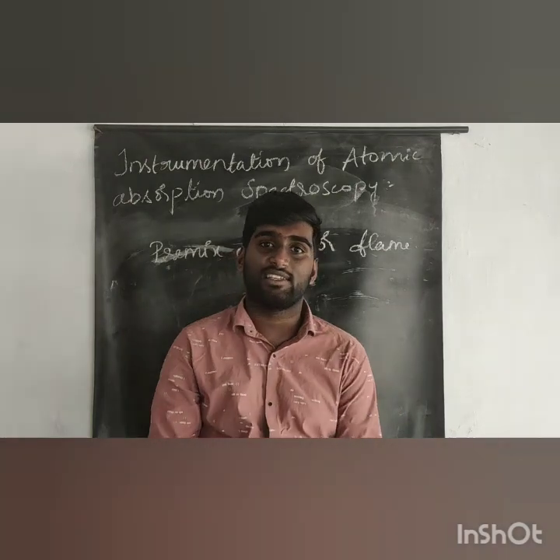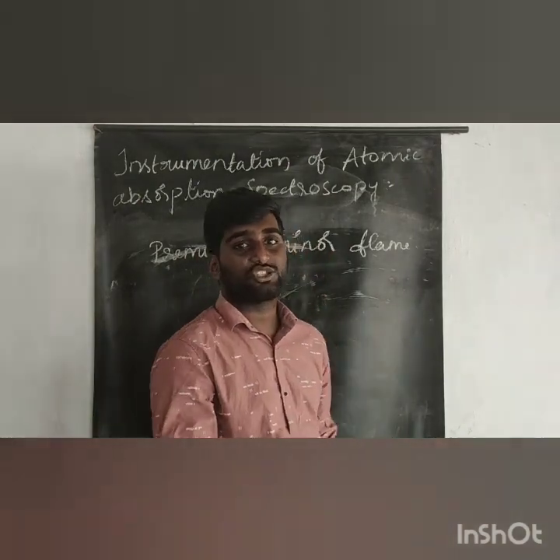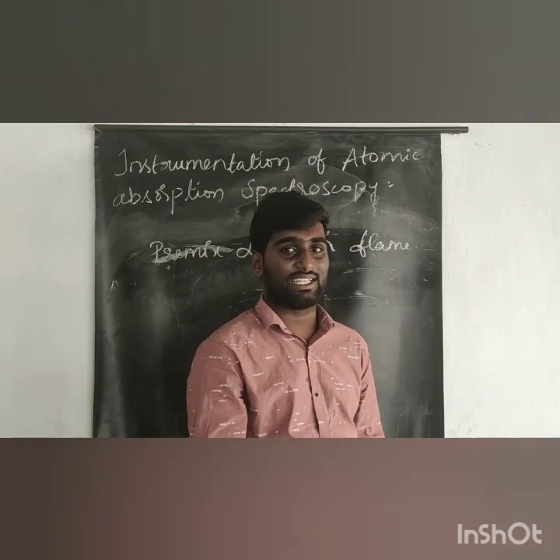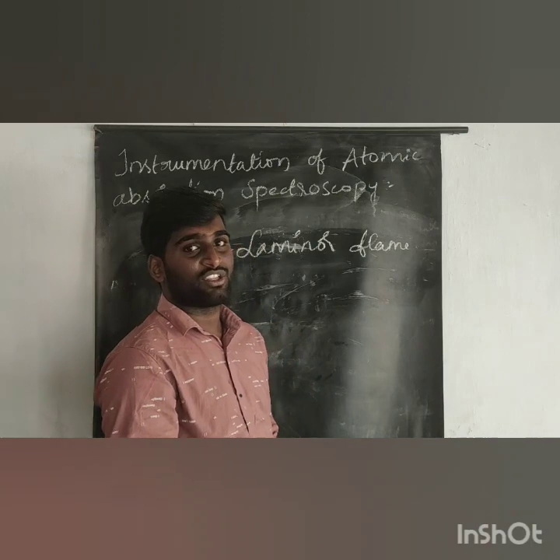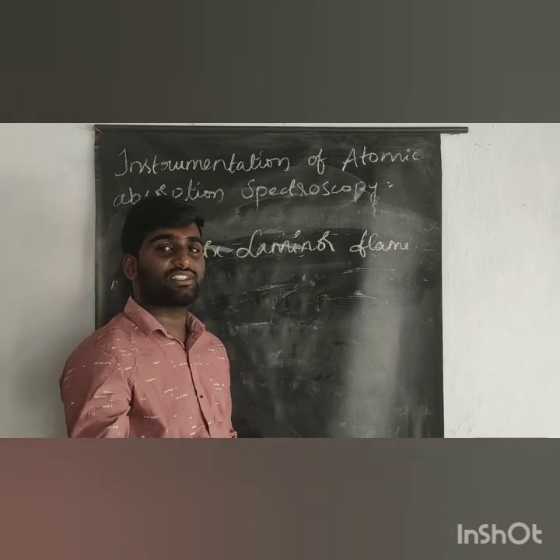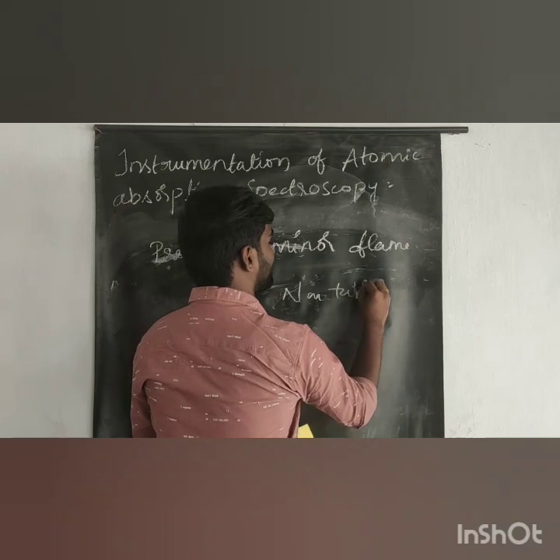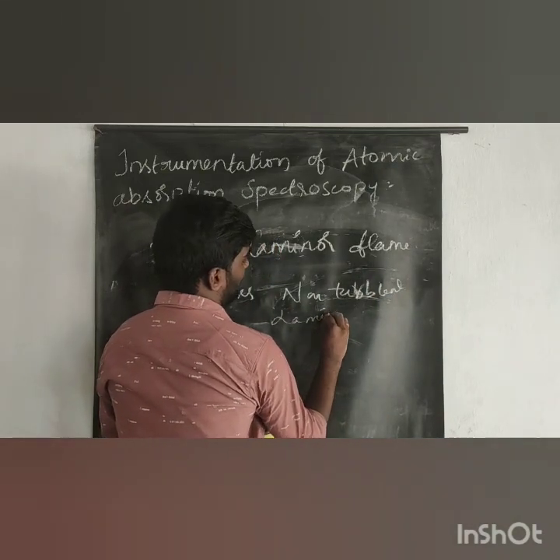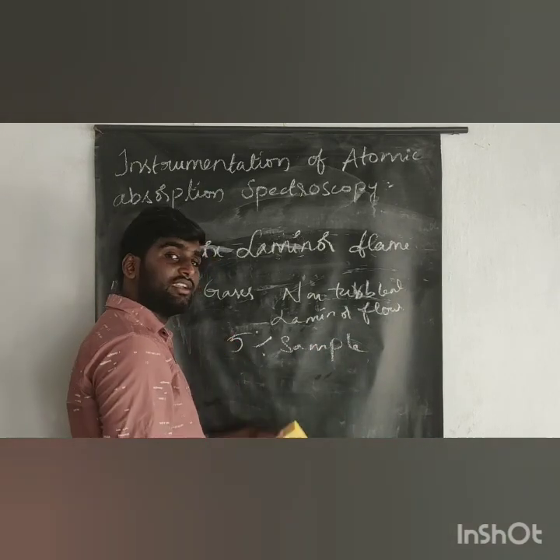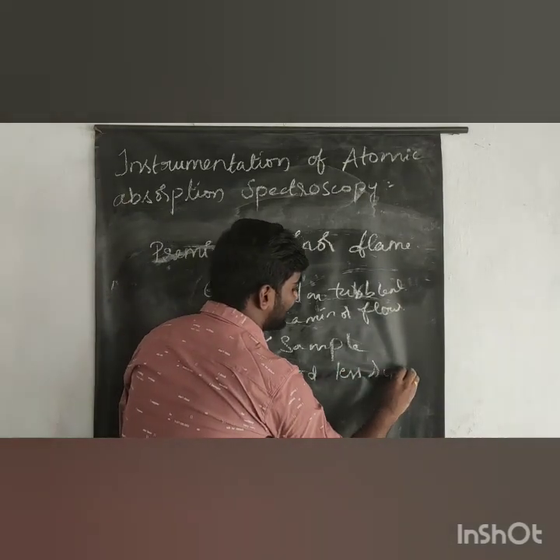Okay, and here the sample is reacted, only 5% of the sample is reacted. And that 5% of the sample will also be decomposed, and the rest of the 95% of the sample is wasted, because of the low sensitivity of the sample. Okay, so here in laminar flow, the aspirated sample is thoroughly mixed with fuel and oxygen, so gases move with non-turbulent and laminar flow. But here only 5% of the sample is reacted and decomposed. The rest of the 95% of the sample is wasted due to low sensitivity.